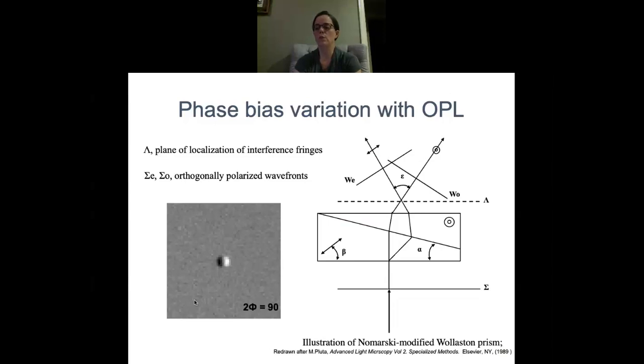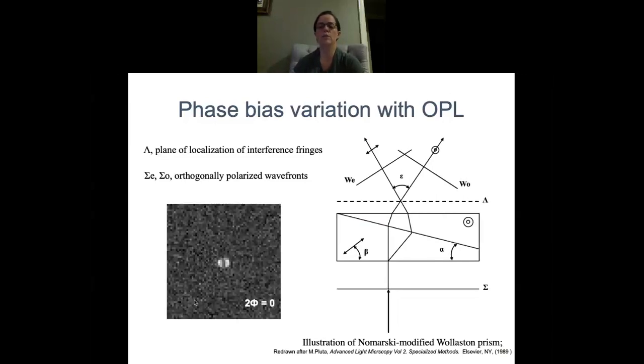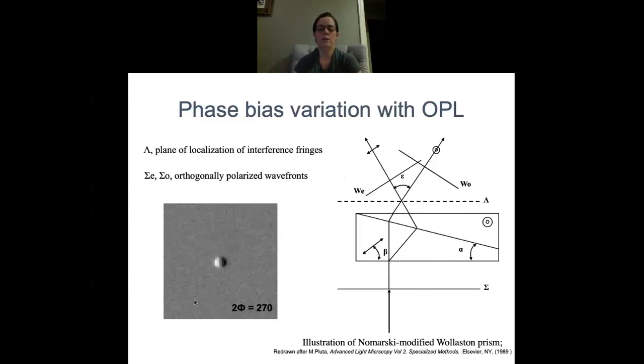In this configuration, you can see the relationship of the intensity in this imaging mode to the differential phase of the object, from where it draws its name, DIC. Removing the phase bias changes this intensity distribution in such a way that the edges of the bead become preferentially brighter, in a similar way to the dark field imaging method. Or greater phase bias could be added to invert the contrast of the differential intensity.